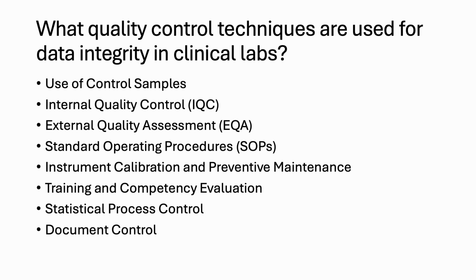External quality assessment, in short EQA, also known as proficiency testing. It requires testing of unknown samples sent by an external agency and comparing results with those from other laboratories. Standard operating procedures. Detailed written instructions to achieve uniformity in the performance of a specific function.